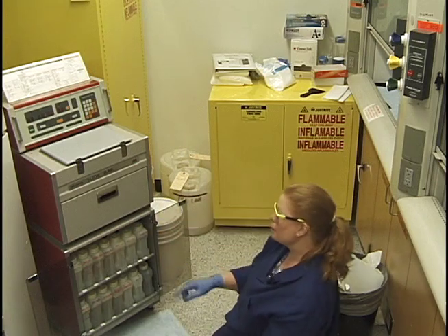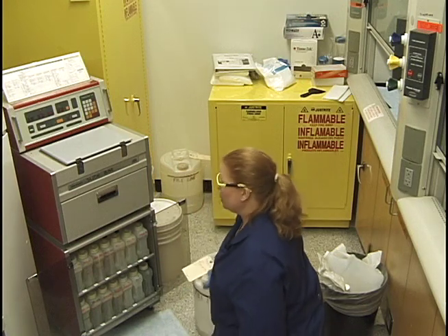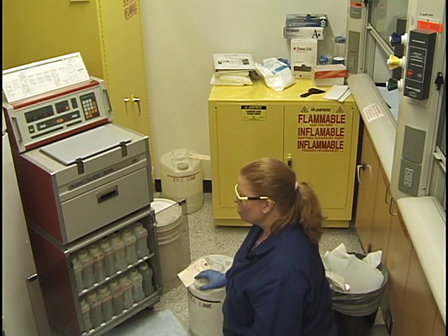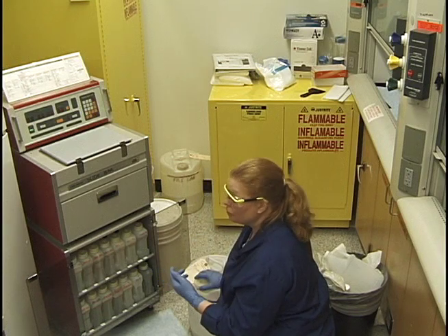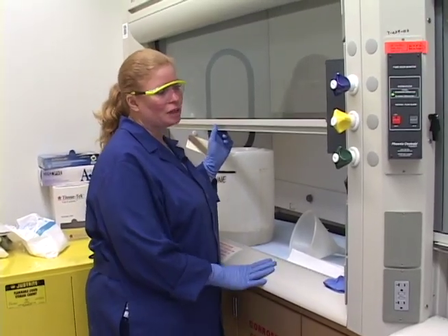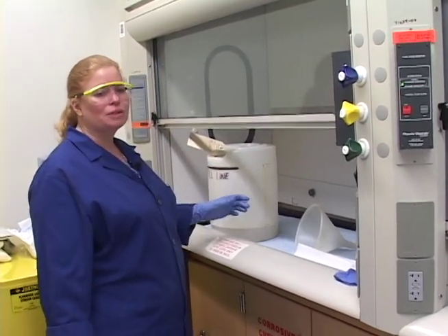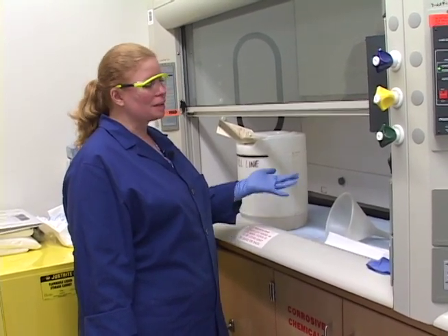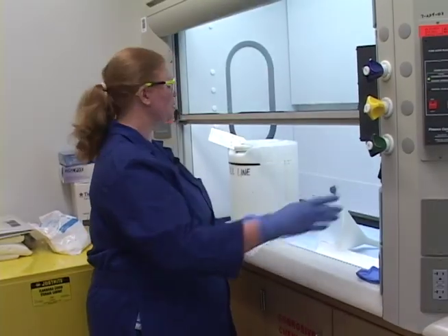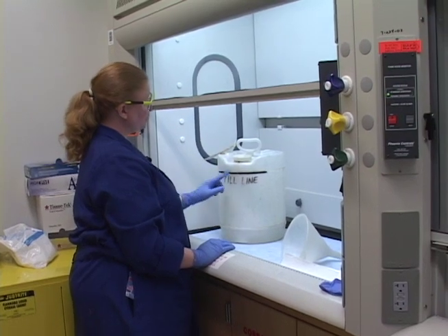The last thing is the formalin. I have a formalin bucket and this is another one you want to do under the hood. The formalin is strong enough that you want to wear goggles — be sure to have goggles on and do it under the hood. The actual fumes from formalin can fix the first layer of cells on your eyes. Actually, there are techniques where people take a Copland jar with a cell smear and let the fumes kind of fix the cells on the slide rather than dipping the slide in it — so that's a technique to keep in mind.